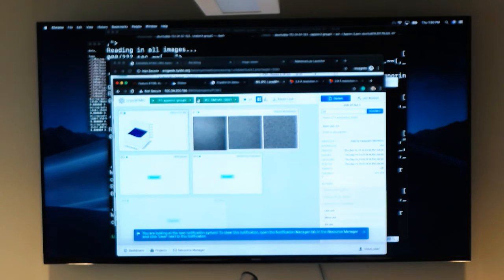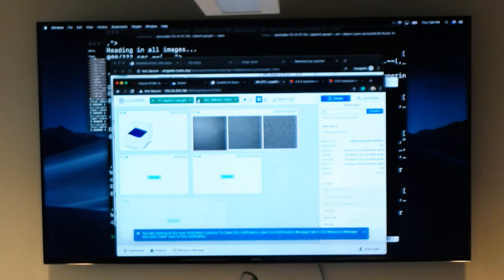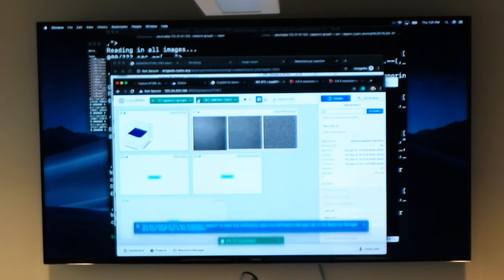What does the log mean? I would have to look at how it's plotting it, 1/d. RELION also has a plot of that. If you keep on going down, this is the noise model, I don't really look at that. And then this would be a representation of angular coverage, direction distribution. So if you have preferred orientation, it will be localized into one area.